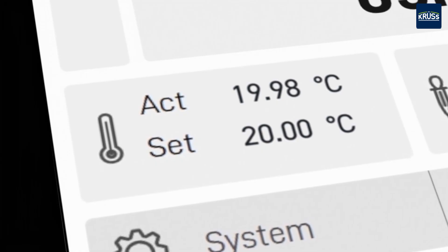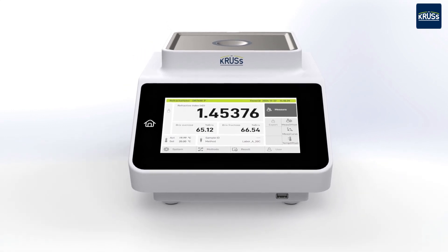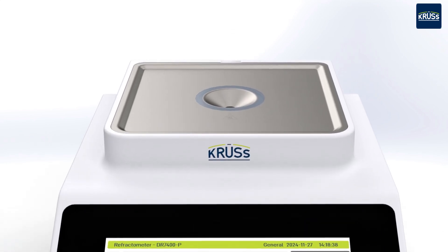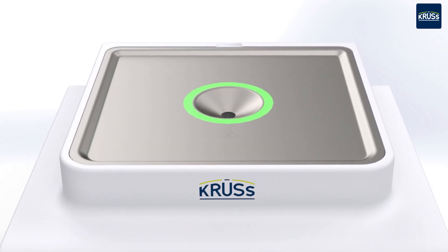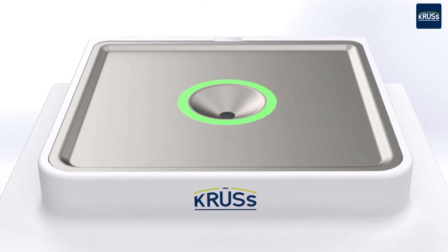The CRUS assistance systems guarantee fast and user-friendly measurements. The CRUS temp gate continuously monitors the set sample temperature, and an LED ring around the sample funnel indicates that the DR7000 is ready to measure.